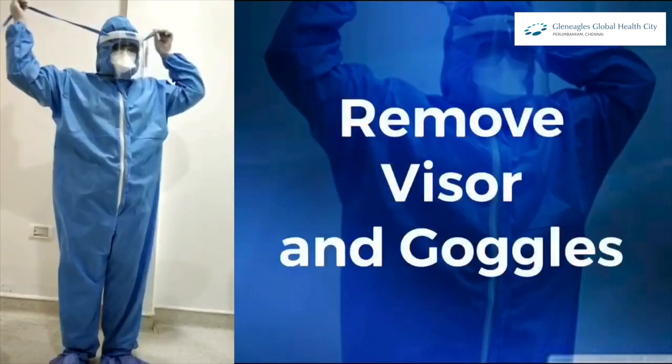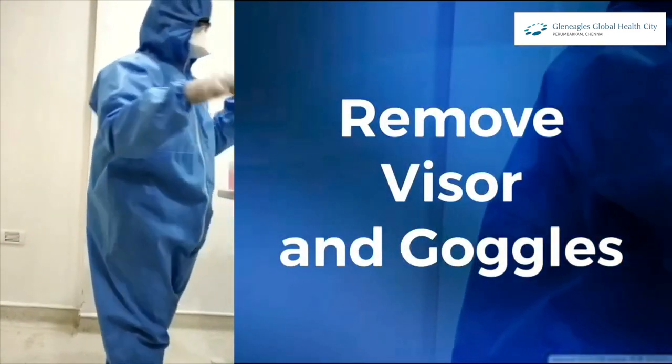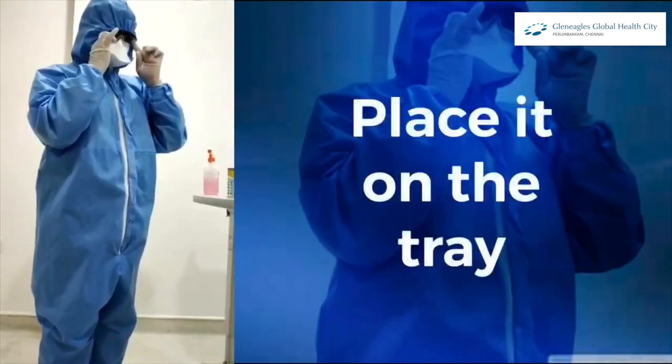Then remove your visor and goggles and place them on the tray.